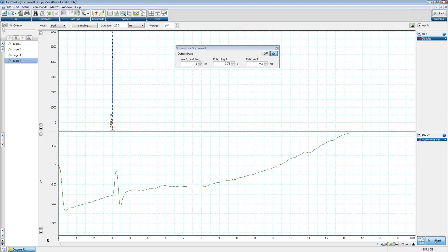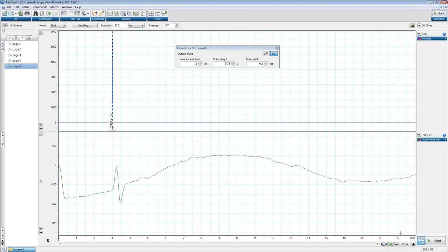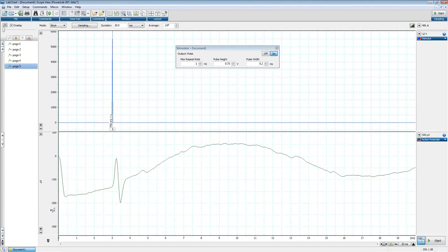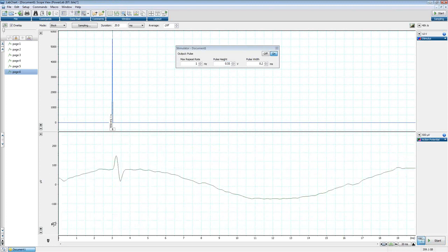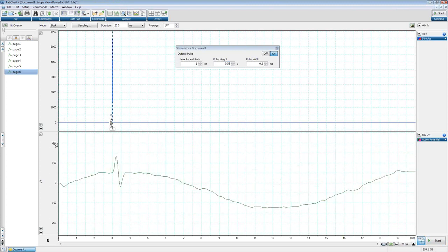So let's see one more time here. We can get a response. Maybe. Hard to tell with these little high frequency elements stuck in my noisy room here. Drop it back down. Tough. But this worm's getting a little old. So that's the general procedure.